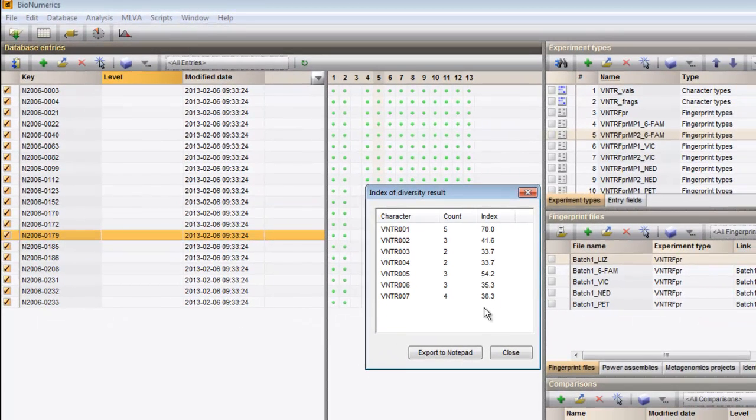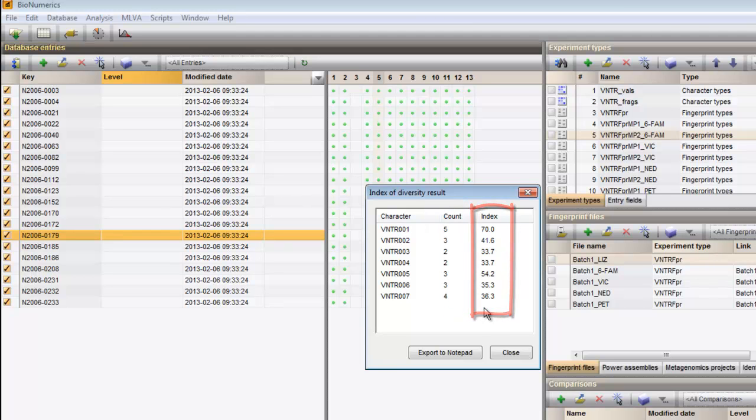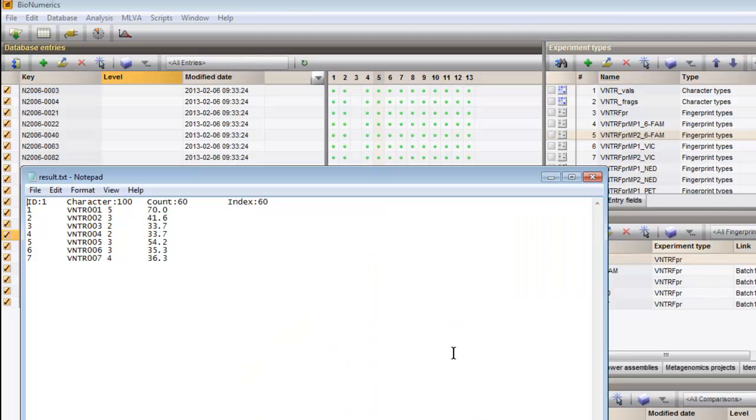The resulting report displays for each VNTR the number of different categories detected and the index of diversity. This list may be exported to a text file.